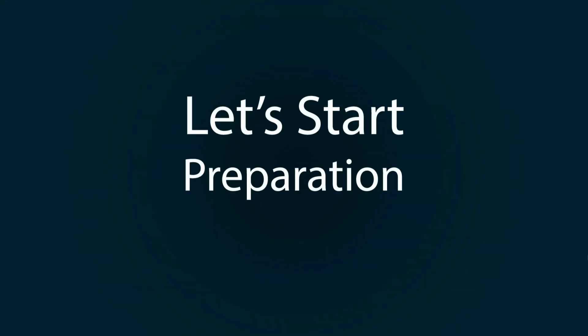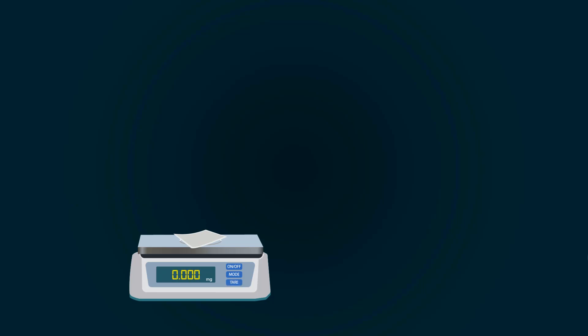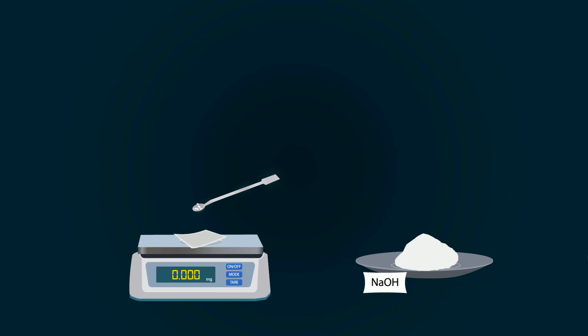Let's start our preparation. For that, take a weight balance and power it on. Put weighing paper and start adding solute on it with the help of a spatula. You have to measure it up to 20 milligrams.